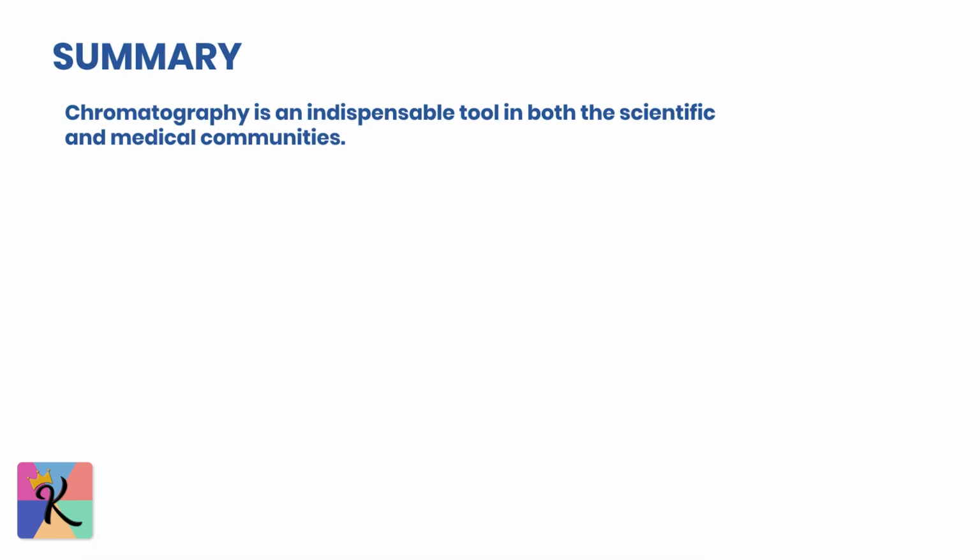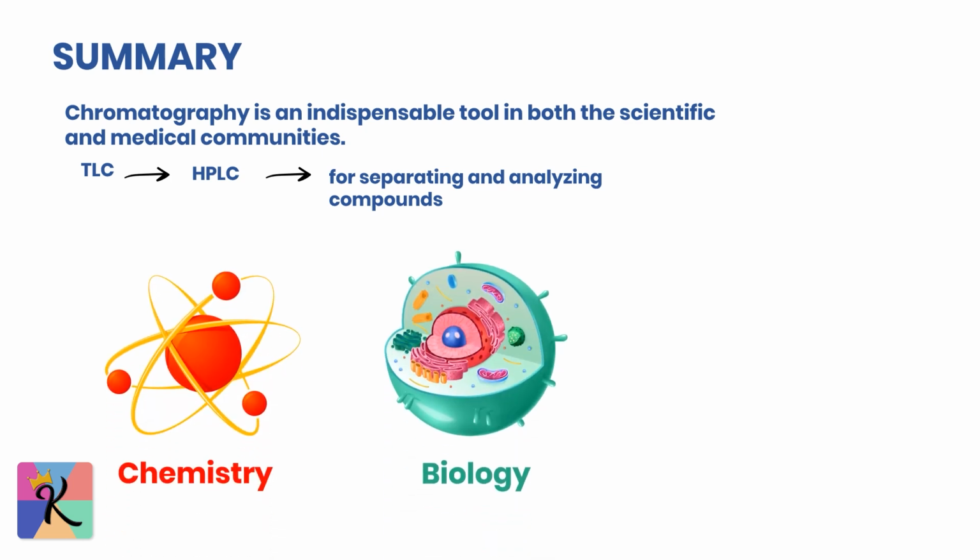So, to summarize, chromatography is an indispensable tool in both the scientific and medical communities. From TLC to HPLC, each technique offers unique advantages for separating and analyzing compounds. Understanding these methods is crucial for anyone working in chemistry, biology, or medicine.